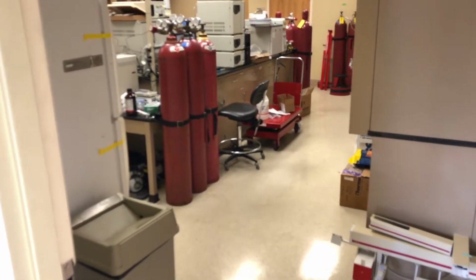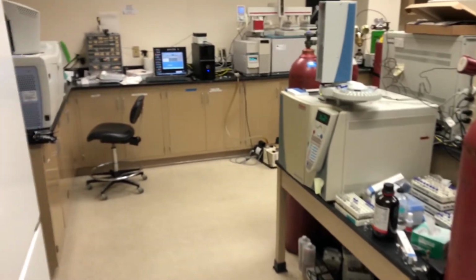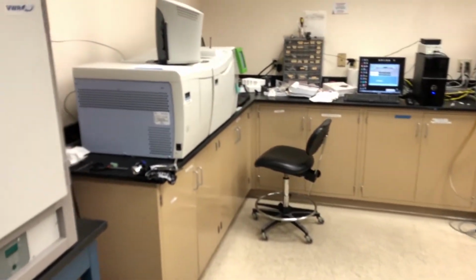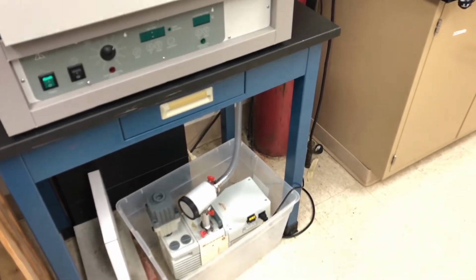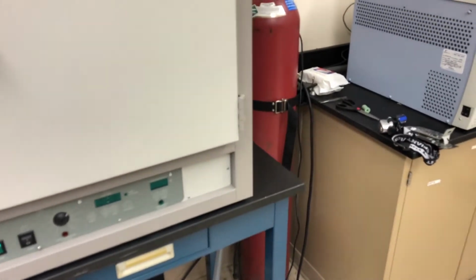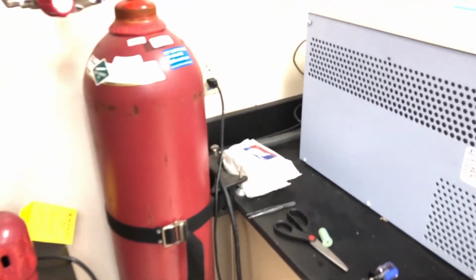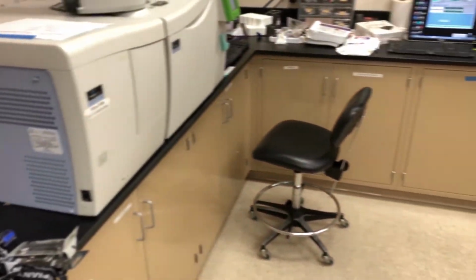So we are taking a tour through the lab here, but we're going to pay attention to those big noisemakers in the lab, those vacuum pumps. So if we go over to our GCMS over here and we look down on the floor, there we go. That is a rotary vane. That's a mechanical pump, also called a roughing pump. There's a vacuum tube connected from that to the mass spectrometer. The other pump for the instrument is inside the instrument.